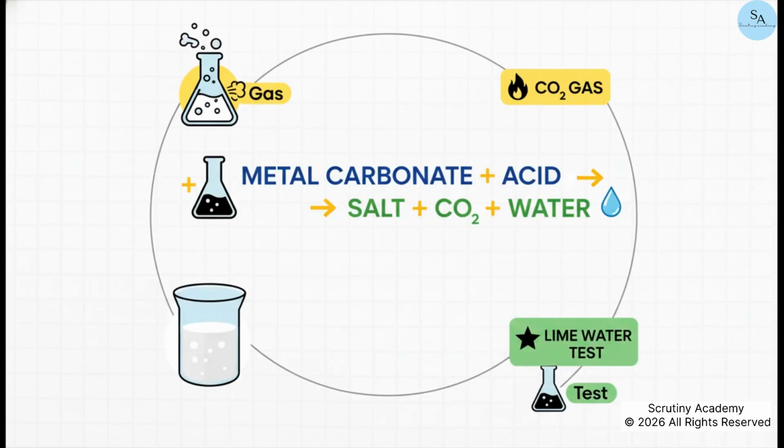And that's it. That is the complete story of how acids react with carbonates. From the bubbling to the milky Limewater test, you now know all the key points. Just remember the general rule. Carbonate plus acid gives salt, water, and CO₂, and you will do great in your exams. Remember it well.